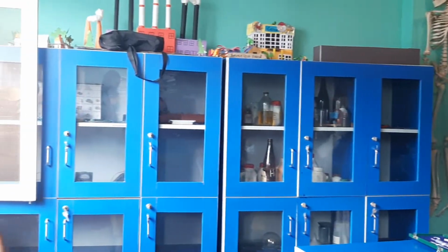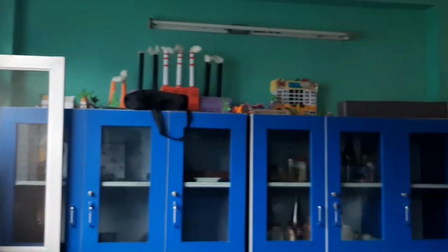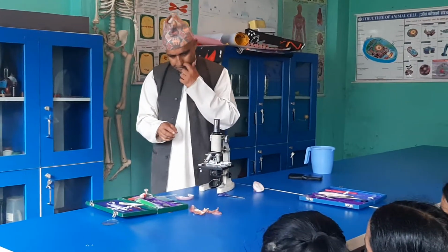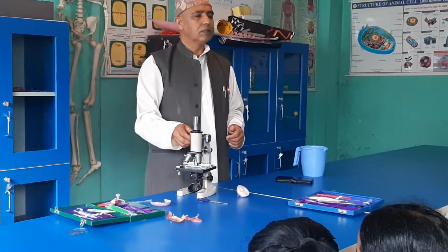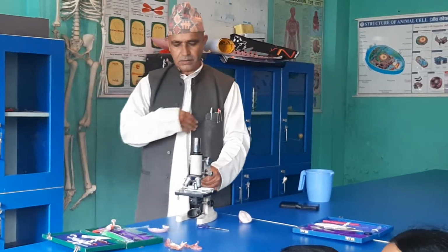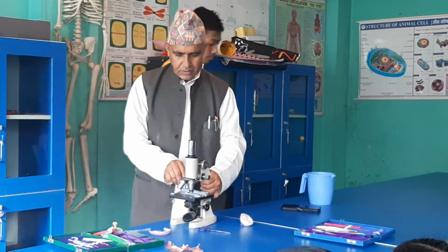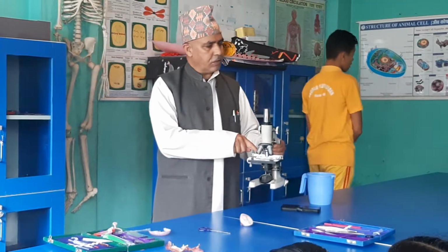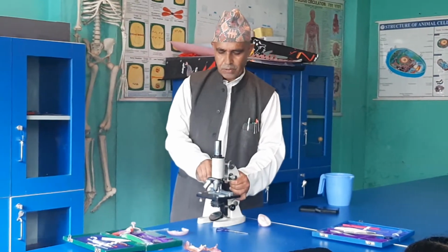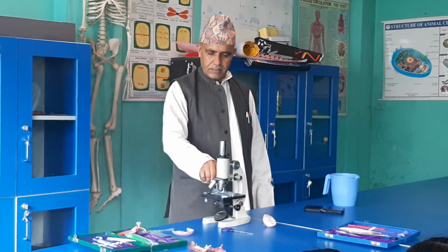Now let me place it in this microscope. What type of microscope is this? Compound microscope. Why is it called compound microscope? Because here are two. You come this side, because light must come directly. Come, you can come this side. Student, look here. The slide is not in the same position as the lens. That's why it must be moved forward. Here is the place to move forward and backward.